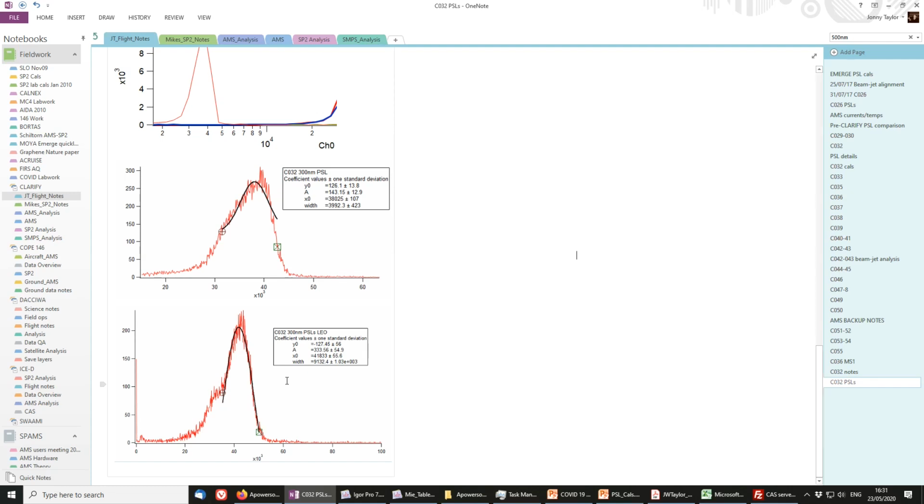So why are these two different? Why are we getting a slightly larger signal from the leading edge fits, 41,833, versus the full Gaussian fit, 38,025, for the exact same particles? Well, it's probably that the alignment isn't perfect, but generally I wouldn't worry about it too much.